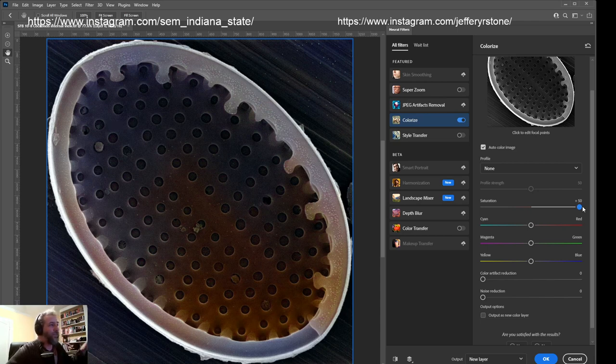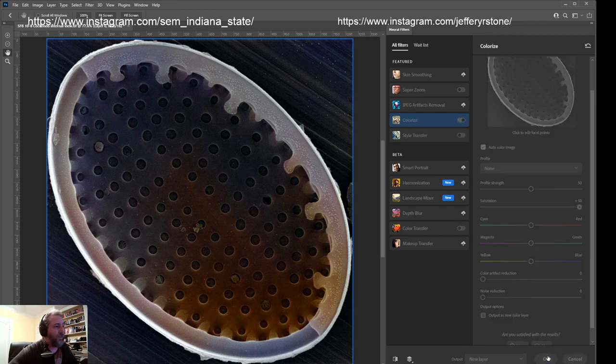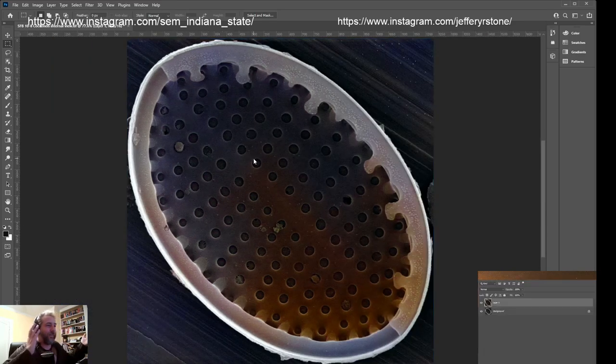I usually now start with this step, and I don't want my diatom to look like a plum or a bruised piece of an apple or something. So purple and light tan are not really a great combination, but it adds a lot of texture, and it actually makes the image, in my opinion, look very realistic. So I usually start with this as a tool, and then I just hit OK, right? So I'm not done. Typically, that's not it.